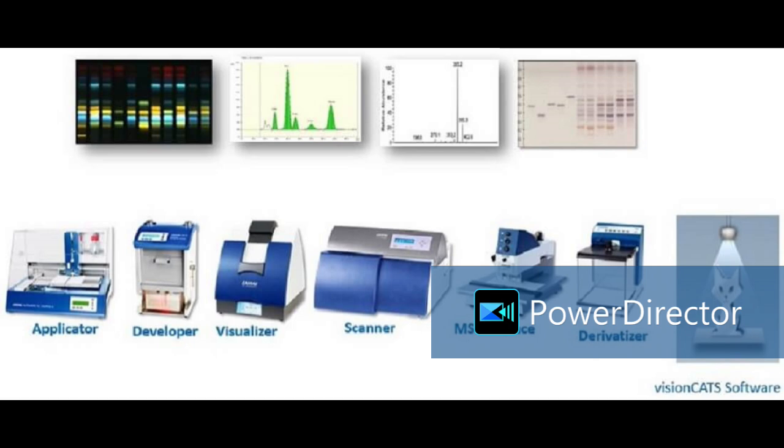In applications, first of all we will check the forensic application. Identification and quantification of different cannabinoids in Cannabis sativa. Generally THC, THCA, they have separated. This is the sample track number 1. You can see in track number 1 CBN, THC and CBD.